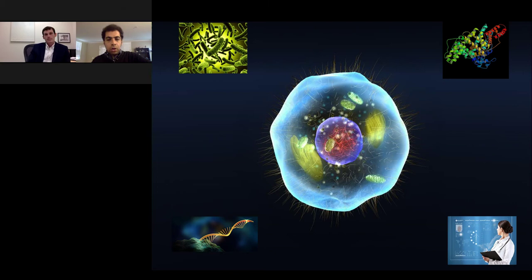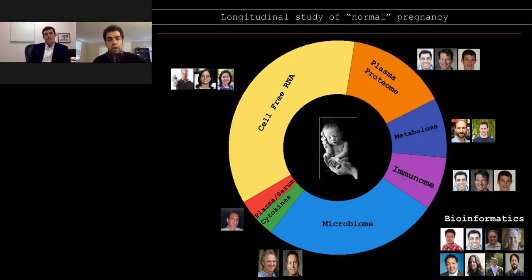All right, so moving on to the second part of the talk. What is special about this mass cytometry platform that we're using is that it's looking at individual cells. That's a very powerful thing to do because cells are the smallest functioning units of life, and you can actually figure out how to modulate them. It interacts with our microbiome, with what happens at a transcriptomics level, at a proteomics level, as well as the clinical context that these patients are in. And we wanted to understand the immune system in this larger picture.